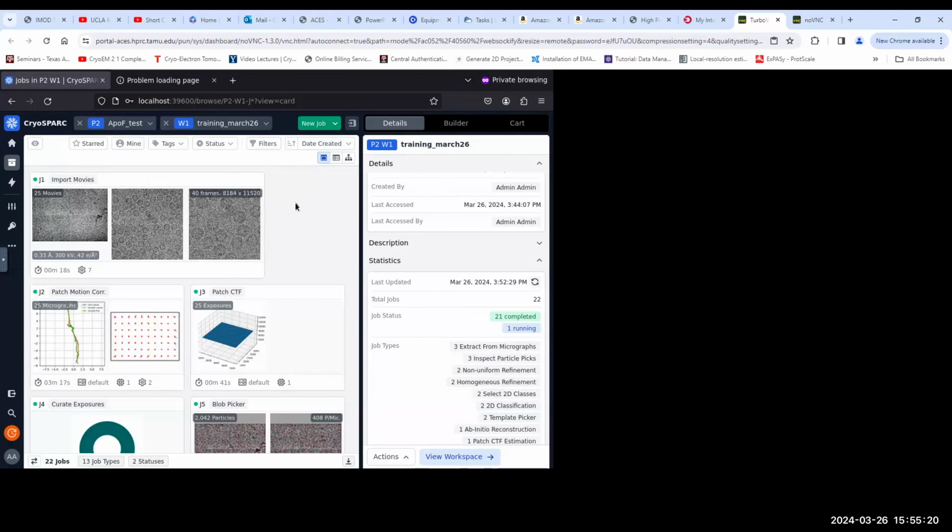It needed a lot of compute time, so I don't know if there's a way to cut down on that, like doing part of the data at a time and merging those later, or when you're doing the refinements.